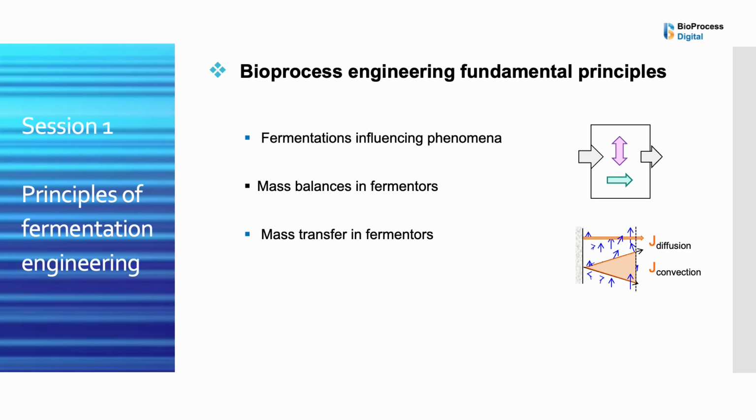Session 1, specifically designed for newcomers to the field, provides a comprehensive introduction to the fundamental principles of bioprocess engineering. During this session, you will explore the following key topics: biochemical and physical phenomena governing microbial fermentations, mass balances in bioreactors, mass transfer phenomena in fermenters.